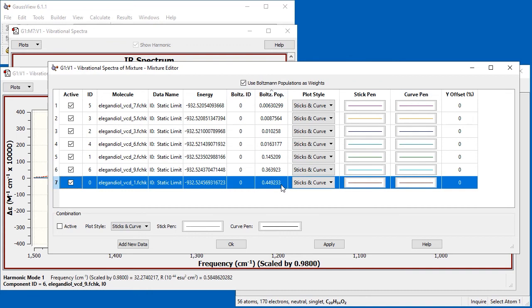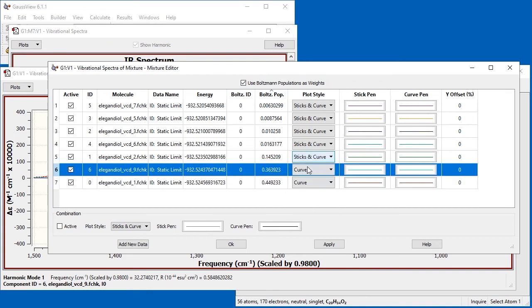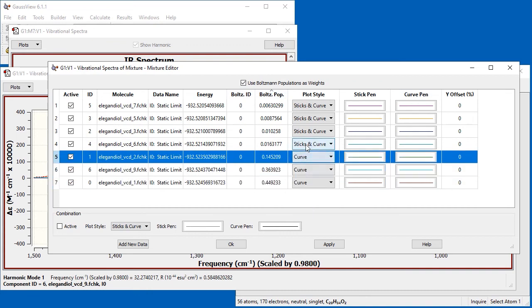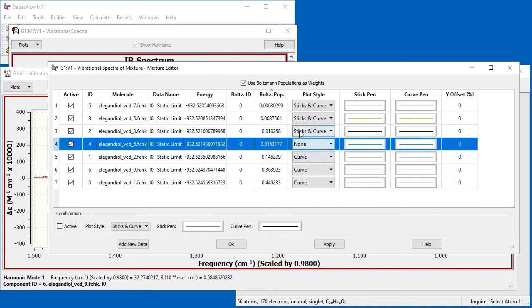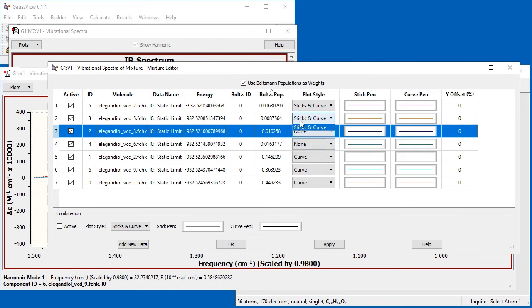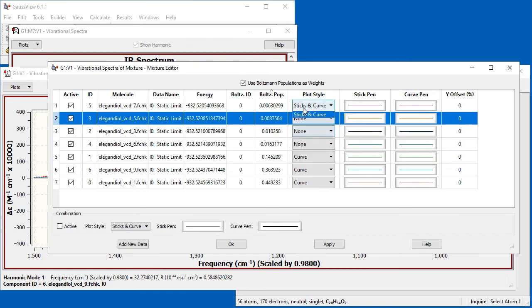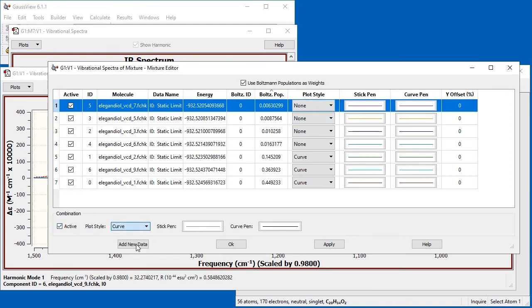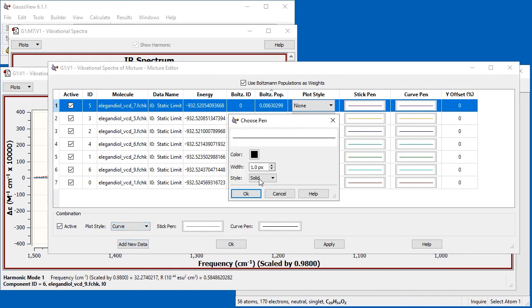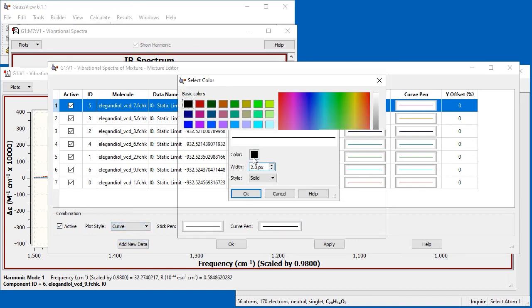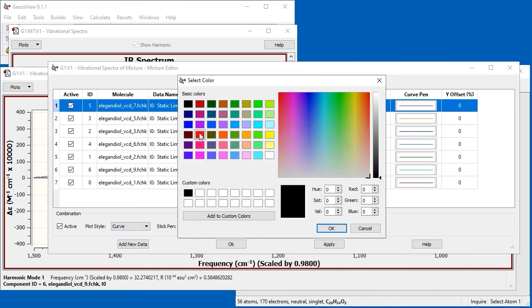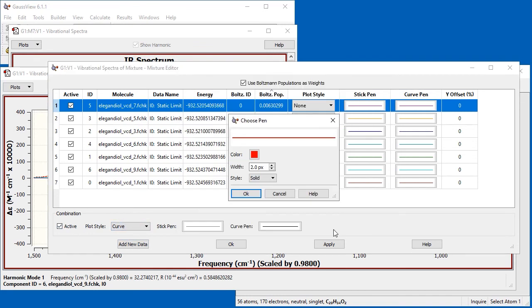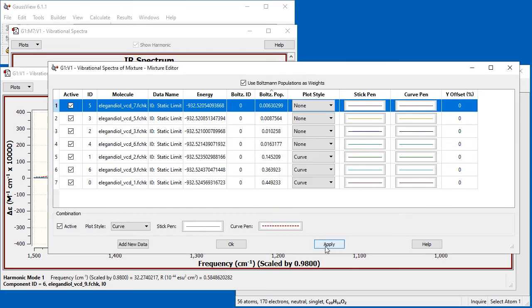So we use the plot-style fields to display the spectra for the lowest-energy conformers as curves, and we remove the spectra of the others by selecting None. Note the data for the undisplayed conformers is still included in the Boltzmann average as long as the corresponding Active checkbox is selected. Finally, we add the computationally averaged spectrum using the controls in the Combination section at the bottom of the dialog. We specify a thick dotted red line for the curve.